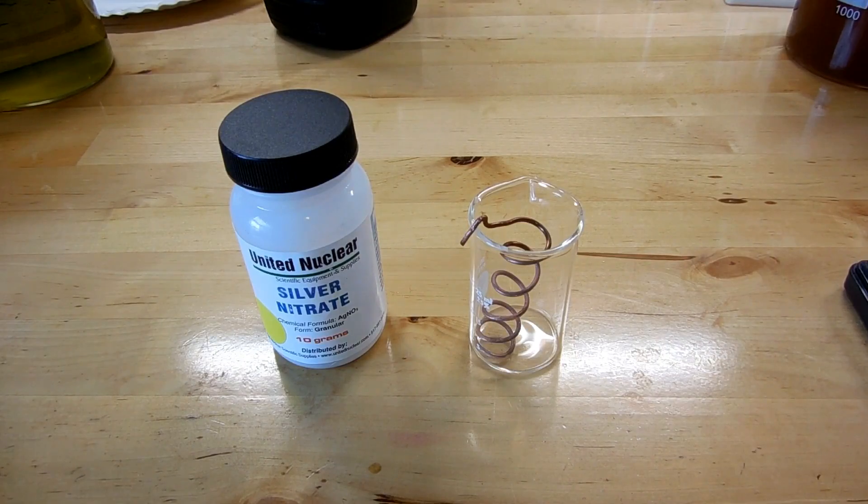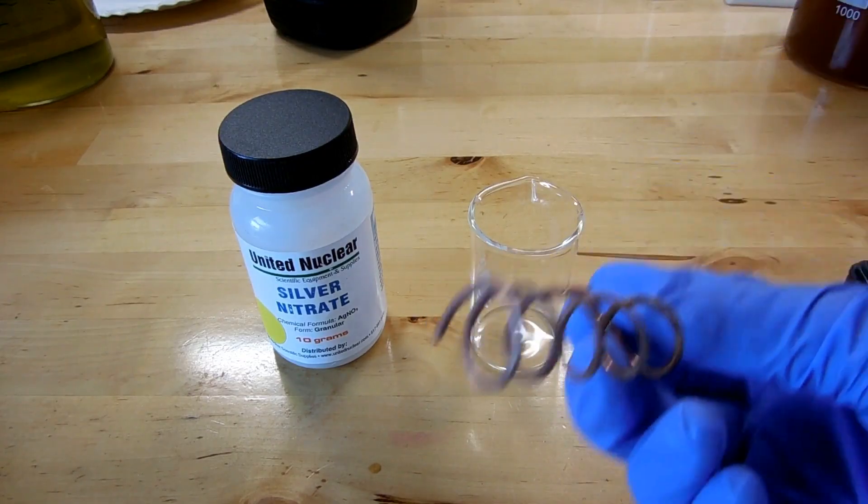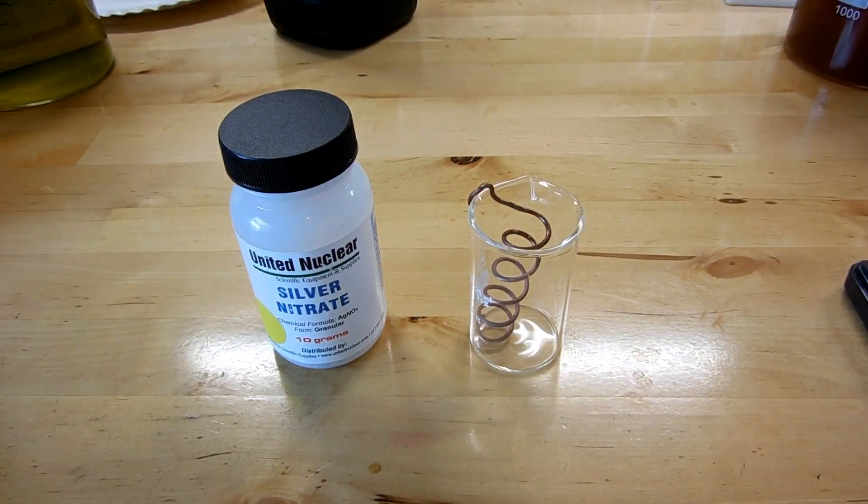All it requires is silver nitrate, which I've got in the bottle there, distilled water, and a bit of copper. My copper is just thick copper wire that I've coiled into a little spring, and I've made it so that it fits into this beaker pretty nicely.